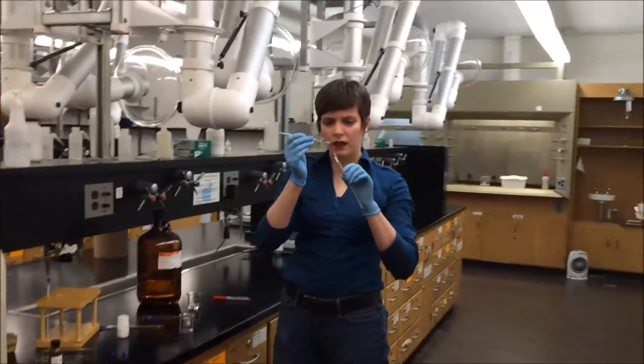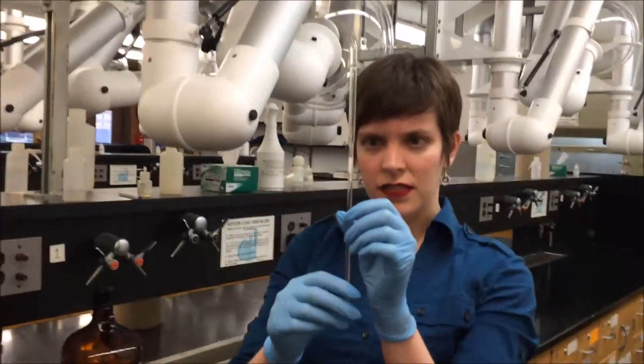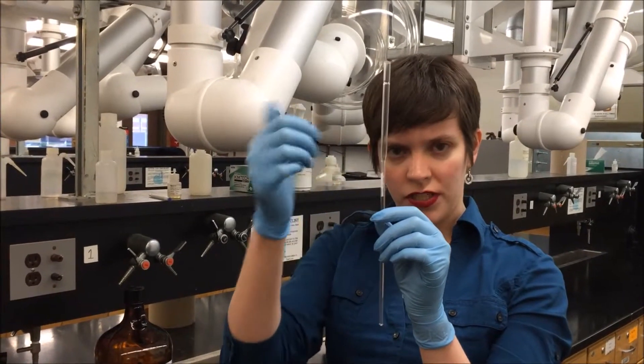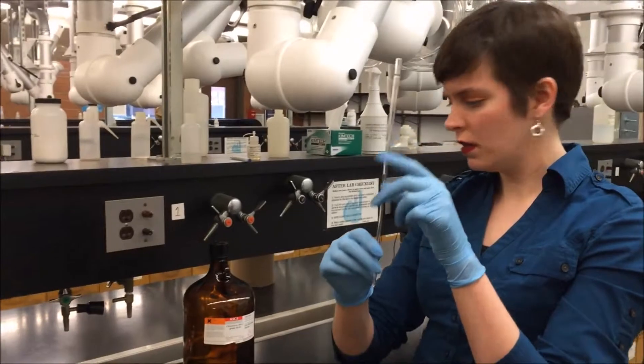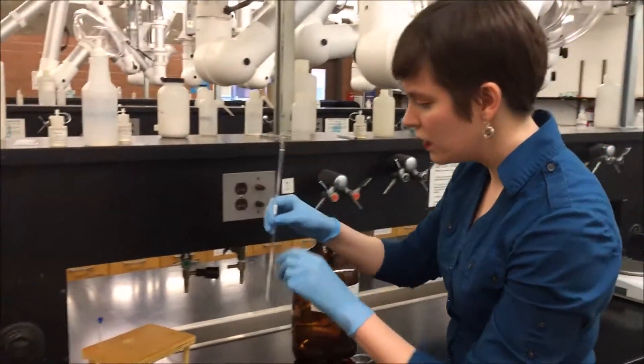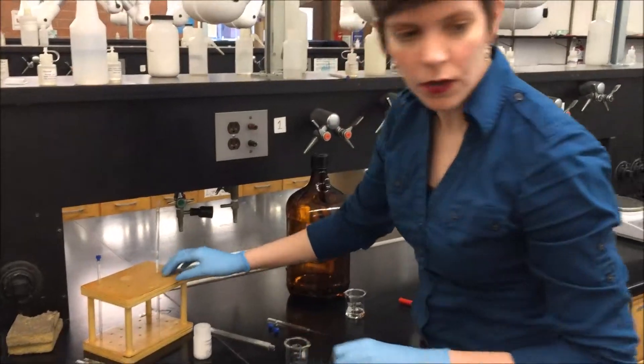Now that I have my sample, I want to get it into the NMR tube, so I just have it balanced in there. It's pretty easy to chip off the tops if you're not careful, so be gentle handling it so it doesn't crack. I'm going to set that in the stand here for a moment.